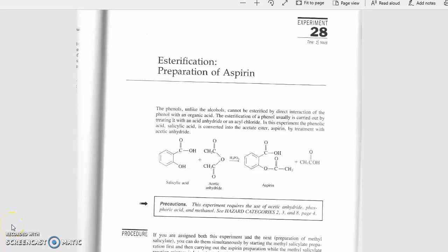Today's lab is going to involve some organic chemistry, and it would be a good illustration. Both of them are going to involve salicylic acid, this molecule right here. One of them, this one right here, is going to be making an ester out of this by not adding it here, but adding down here, over here.